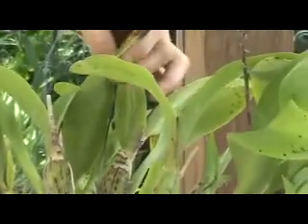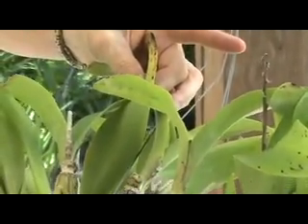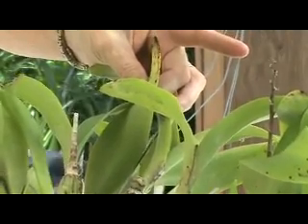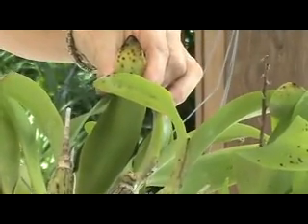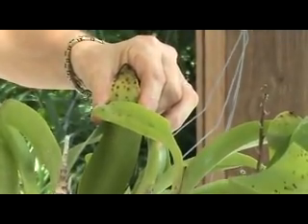That's the top of the leaf, and that's the bottom of the leaf. We're going to go ahead and test this and see if it's virused.